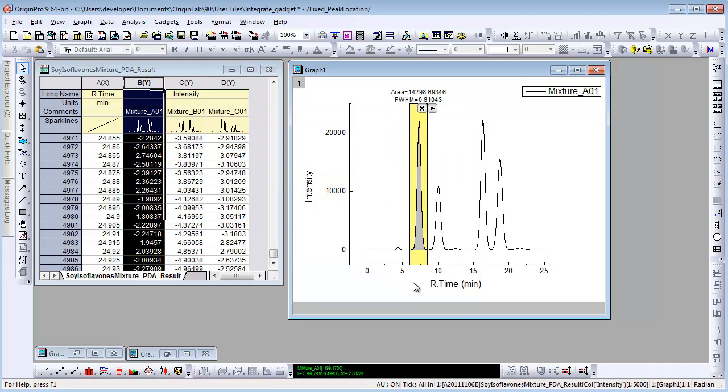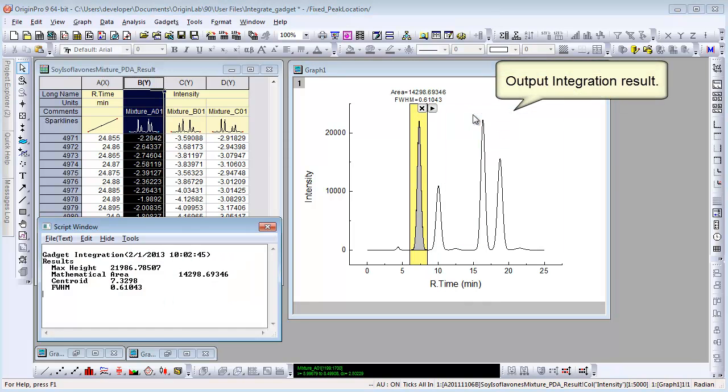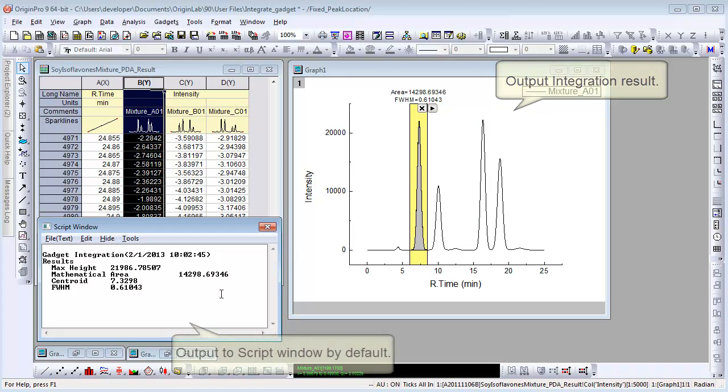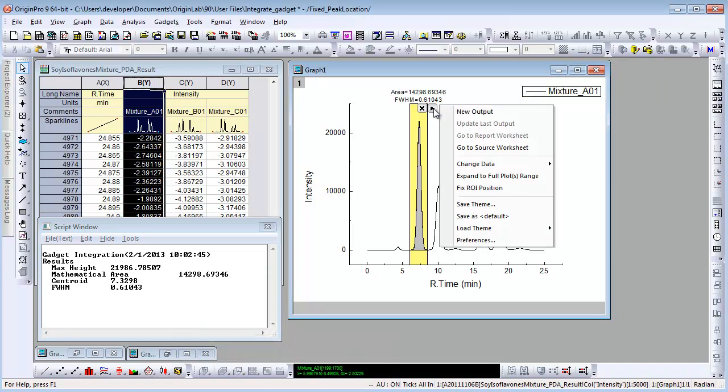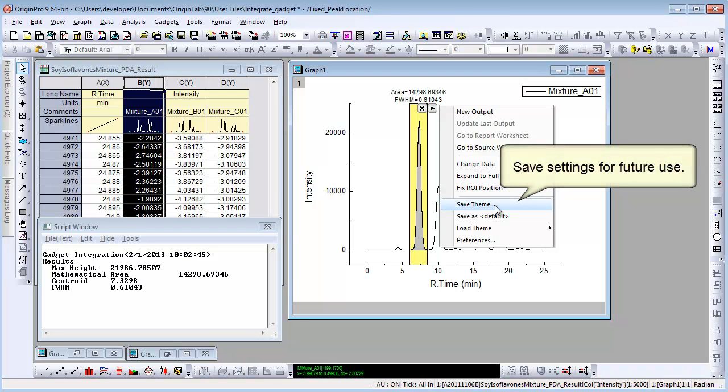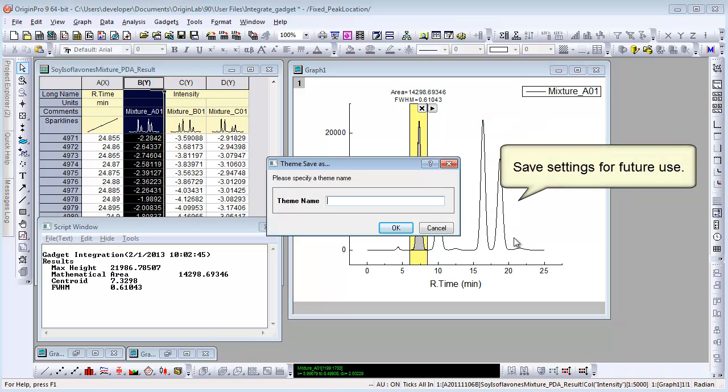Then we can choose New Output to dump the integration result. By default it's dumped to Script Window. You can save the settings as a theme file for future use. Let's call it First Peak.